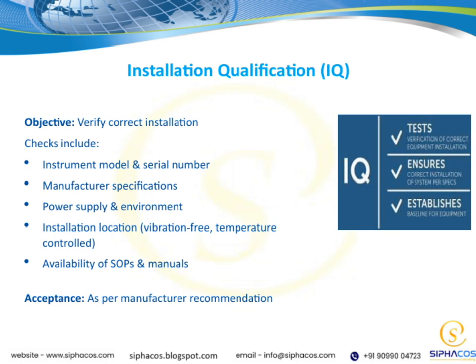Another critical aspect is the installation location itself. It should be vibration-free and temperature-controlled to prevent any external factors from affecting the instrument's performance. Finally, we confirm the availability of standard operating procedures and manuals. Having these documents accessible ensures that operators know how to properly use and maintain the equipment. The acceptance criteria for IQ are straightforward. Everything should be in accordance with the manufacturer's recommendations. Ensuring these points are checked and verified helps us maintain quality, consistency, and compliance throughout our processes.